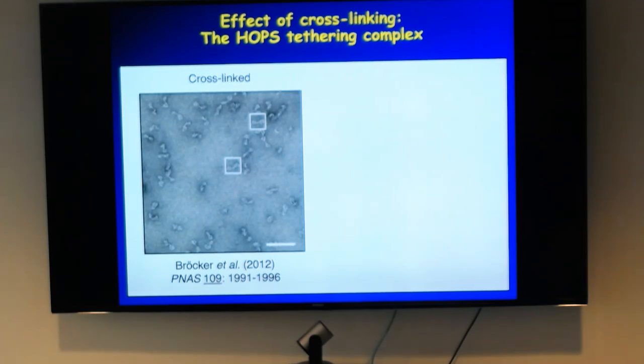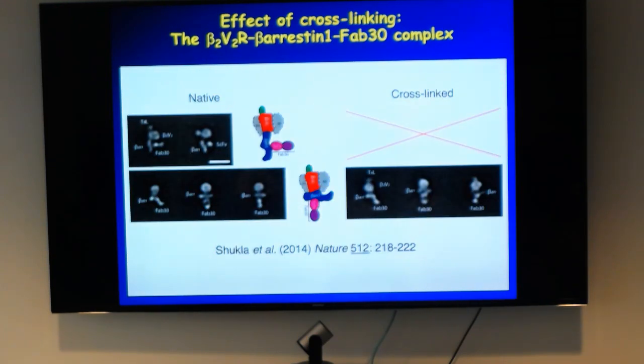That image before, those are all from negative stain? All negative stain. Perfect, okay. I just wanted to know what to expect for 2D class averages in cryo versus negative stain. Yeah, in cryo you see much more, of course, but there's also a small particle.